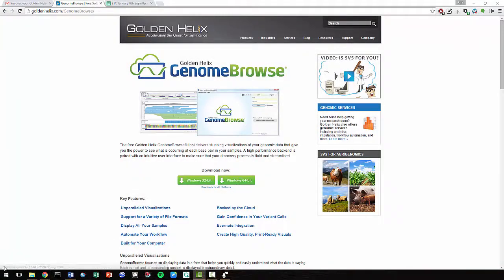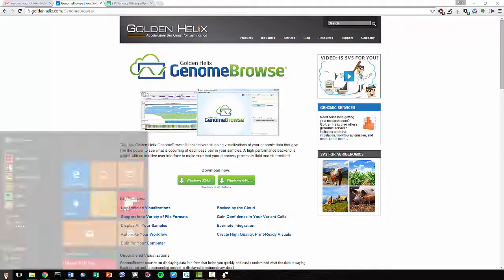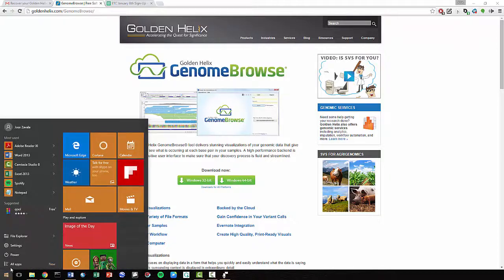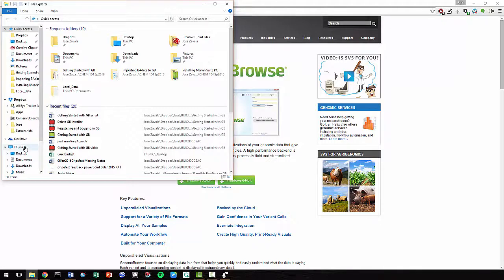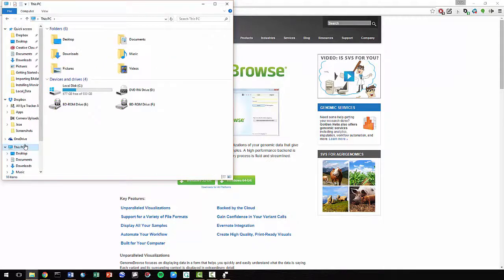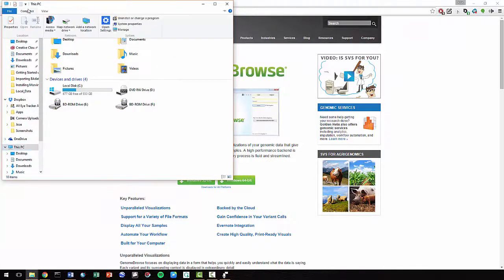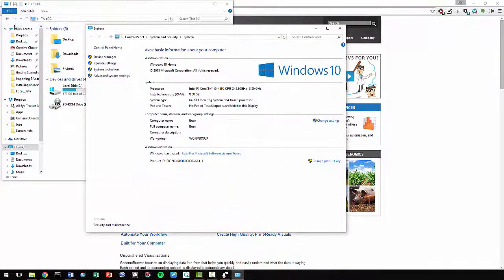go to the Start menu, open File Explorer, go to This PC, select Computer, select Properties.